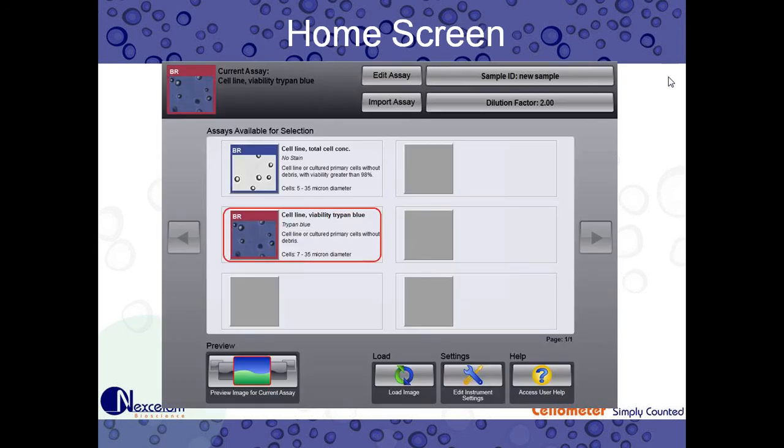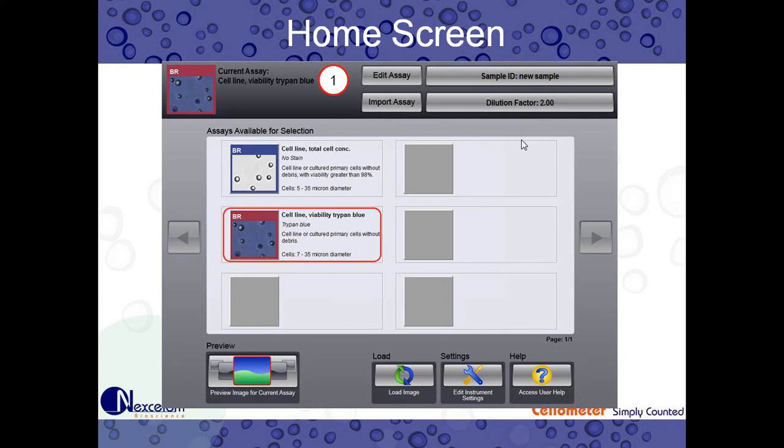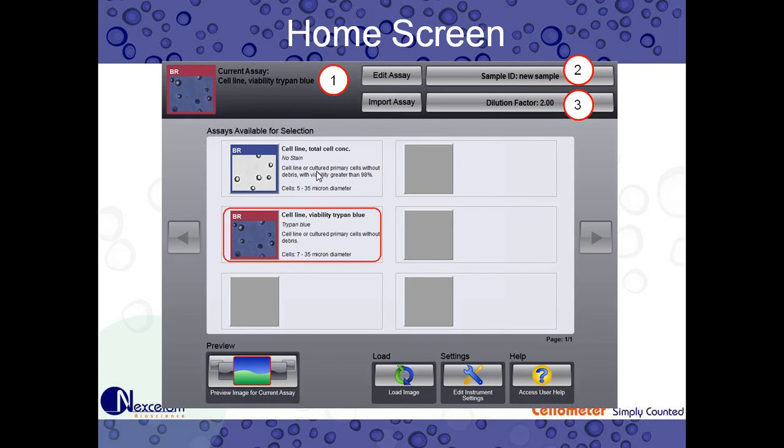So next, we want to get familiar with our software. First, we're going to cover the home screen. So this is what you see when you start the software. This is our home screen. This is where we select our assays. So you can see up top, our current assay, Cell Line Viability Trypan Blue. It is outlined in red. That way you know it's selected. And then numbers two and three, we have our sample ID and dilution factor. Those are going into a little bit more detail when we go over the data management features. But the users, you guys can enter in a sample ID, a custom sample ID, or a custom dilution factor based on the final dilution performed on your cells.